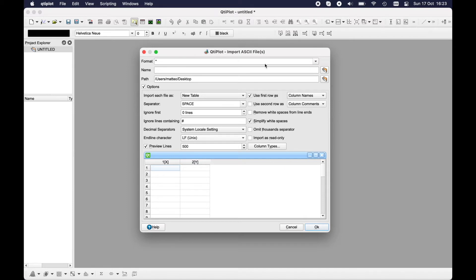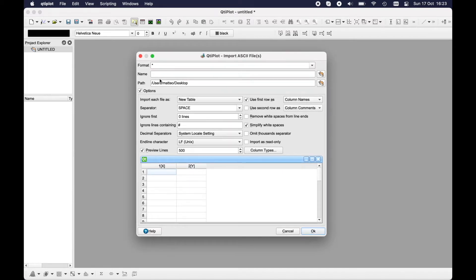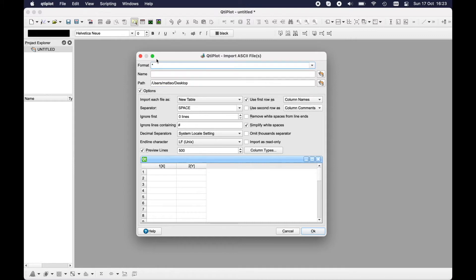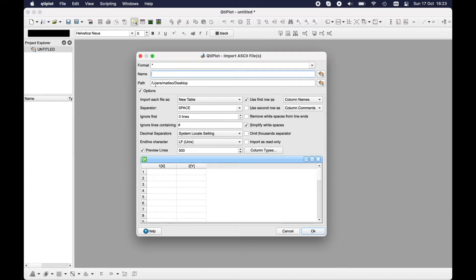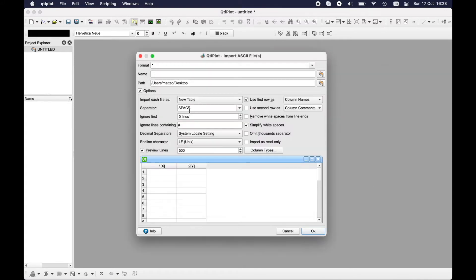Here you have the main import window where you can select a specific format. In this case I'll keep all kind of file formats. Then you can choose the name of the files you have to import. You can import more than one file at a time. Here you can select the main path of the folder containing your files. I selected the desktop folder and I have one file inside. You don't have to select the file there, just the folder.